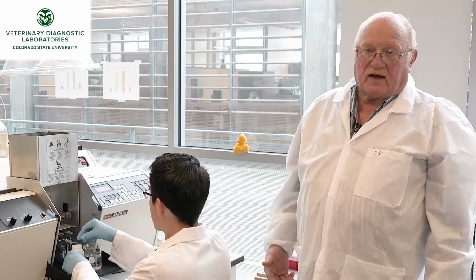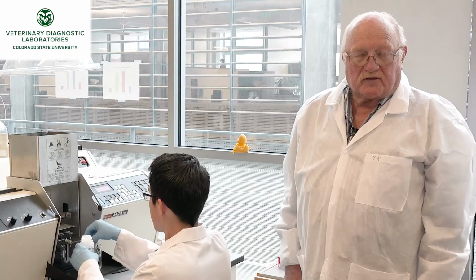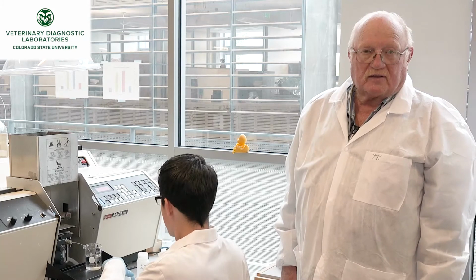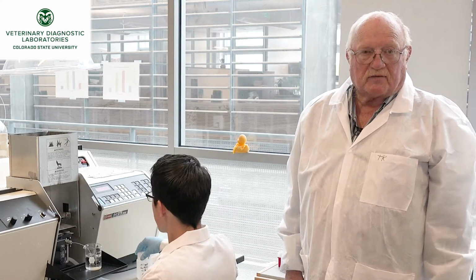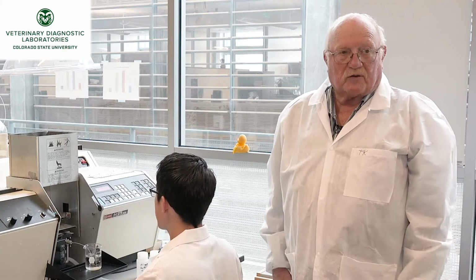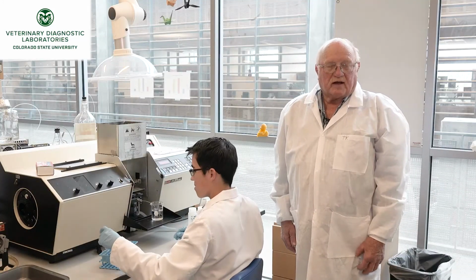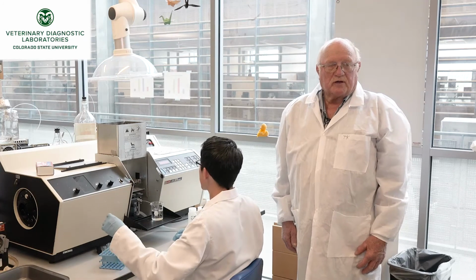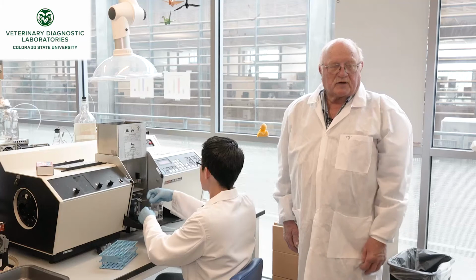Once we have the concentration for the sample that's put into the instrument, then all dilution factors and the sample weight are taken into consideration, and then the parts per million of that element is expressed that way, and that's what goes out to the client in the report. We have normal and deficient and toxic values for about everything we do, and so then they can compare what their animal is compared to the normal.